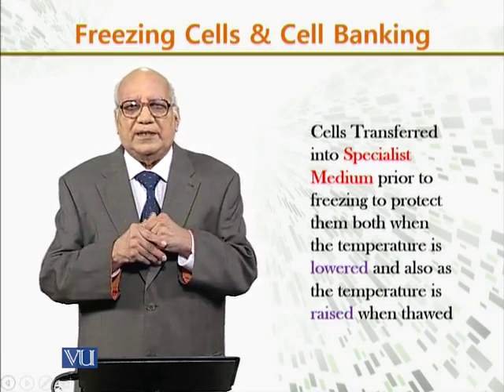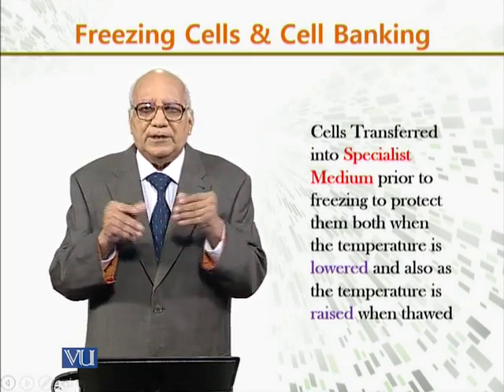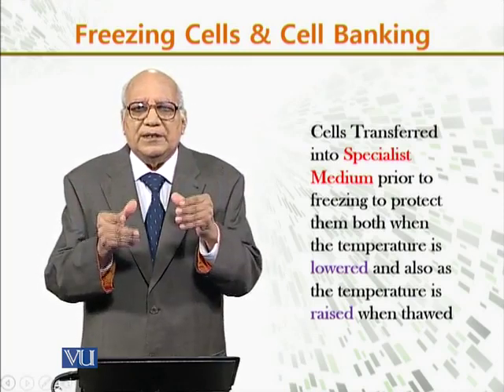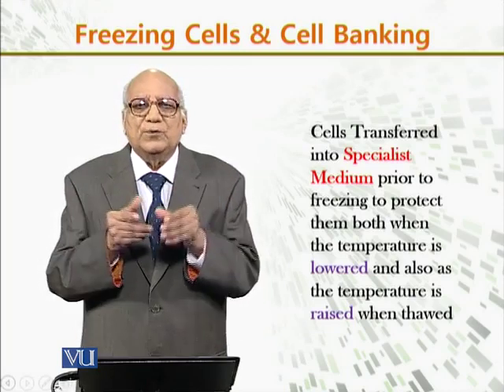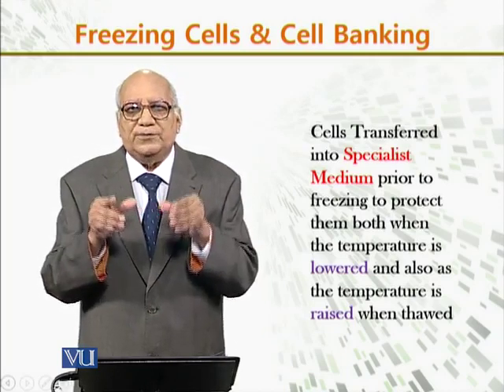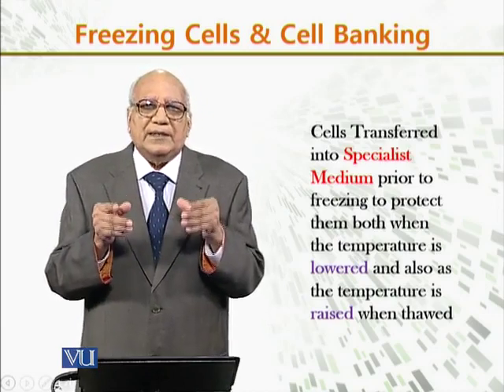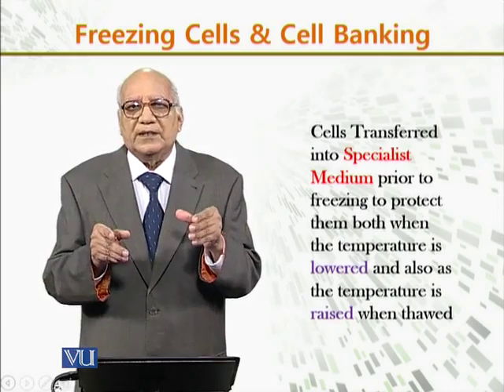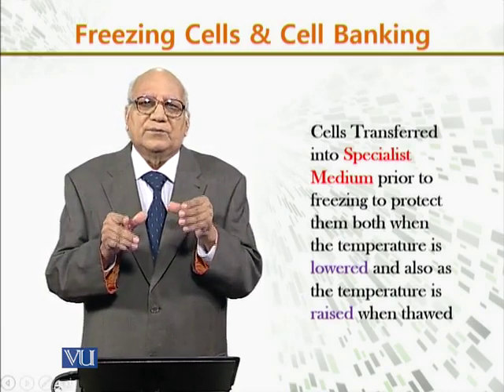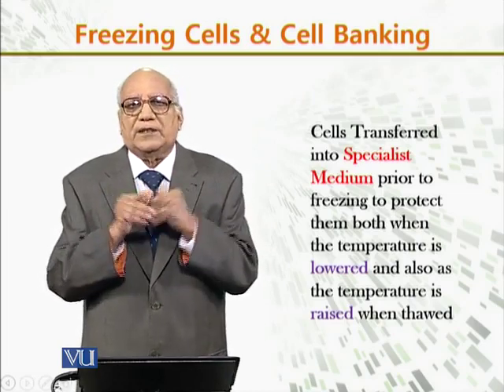Imagine the cells are taken and first put into a special medium prior to freezing. This is very important, because if we don't do this, then we will damage the cell structure, and we won't be able to utilize the cells again after time.